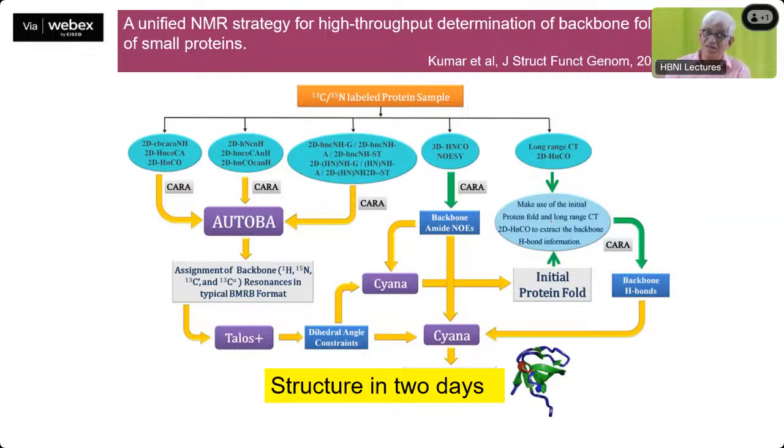She was not an NMR specialist, but a software specialist. She wrote a software to analyze all of these spectra in an automated manner. And so the consequence, you are able to obtain the structure of a small protein in 2 days. You compare that with what it used to take in 2 years in the very early days. Earlier it is only proton and NOEs. It used to take 2 years. Here you can do in 2 days.